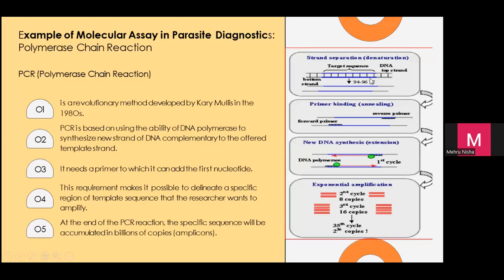Suhu yang tinggi. Selepas dia pecah, macam ni lah, pecah bagi dia dua bahagian ya. Kita ada sequence ATCG ya, yang dia akan bind, call it forward primer, reverse primer, untuk mengamplikasikan region yang kita nak di sini.